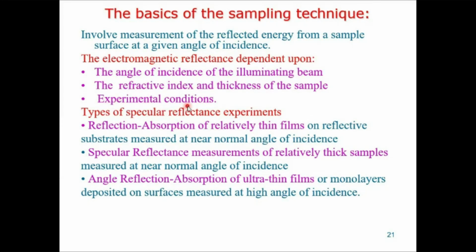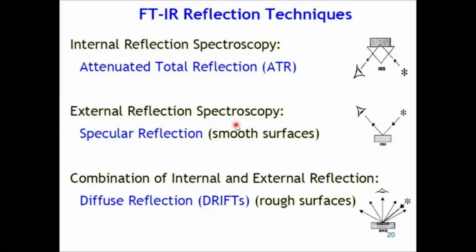Now, types of specular reflection experiments. When we say specular, we are actually referring to this type.